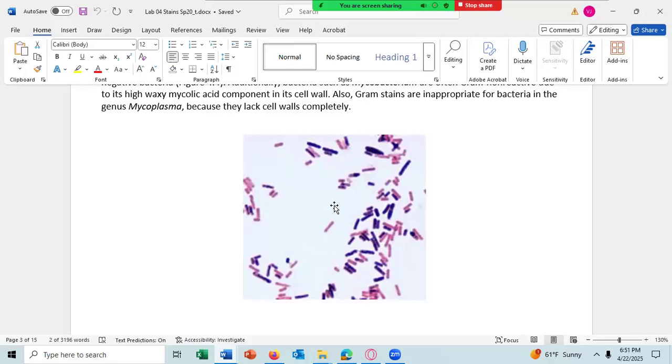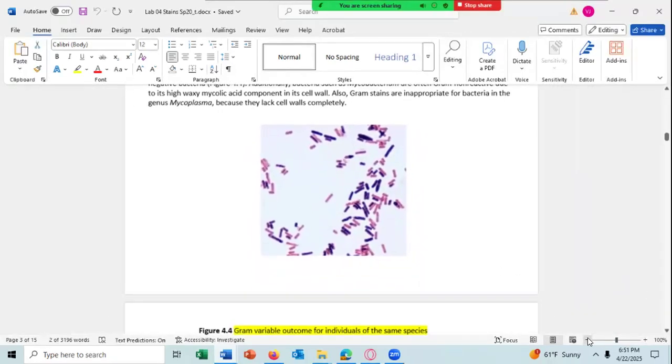To do the gram stain, you should only do it on cells which are 2 days old or less. The gram stain needs young growing cells for the stain to stain correctly. If the cells are more than 2 days old, some of the cells will be dead and they may not stain correctly. Any question about any of that?